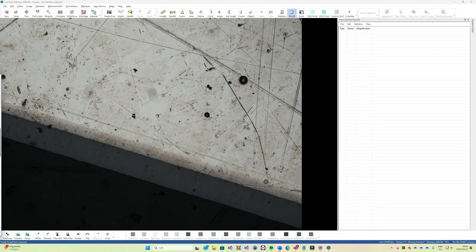I have started up Picsara, and as you might be able to see, I have a cross-section of a turbine blade here. So just assume you have a standard procedure where you want to measure something in the same way over and over again.